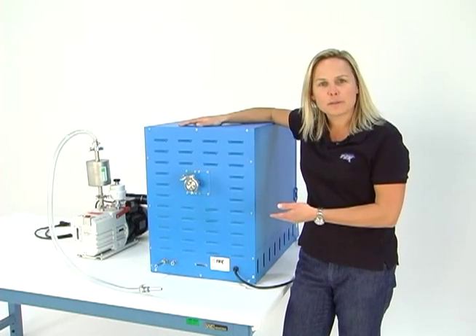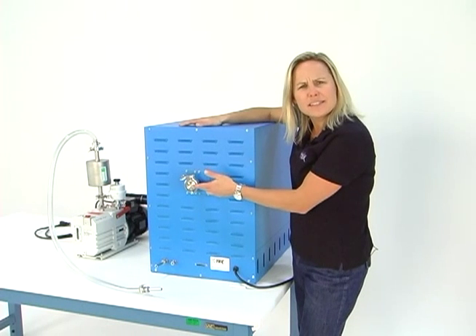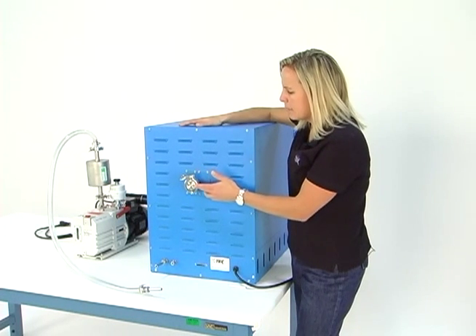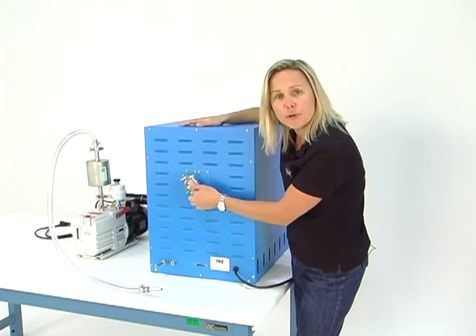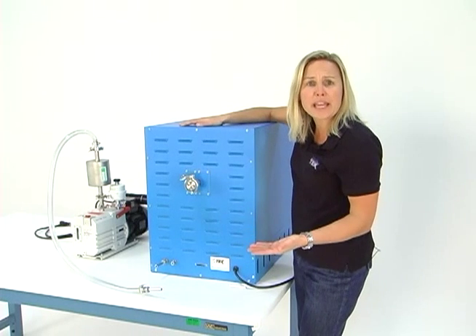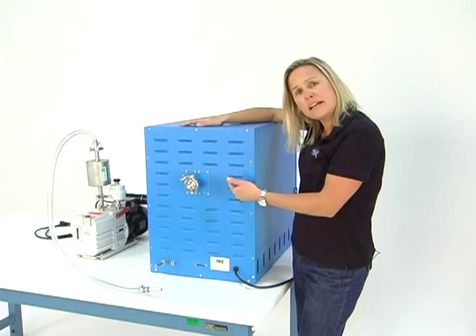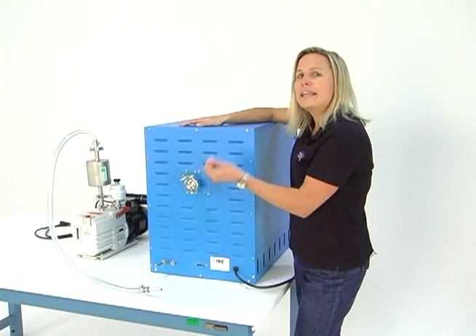Here's the back of your TV-02. People ask me all the time, what is this in the center here? This is actually what's called a KF-25 vacuum port. It's blanked off for you right now, but a lot of people use it to run thermocouple wires inside the oven, or any kind of feed-through that you need. This is your access port inside the oven.